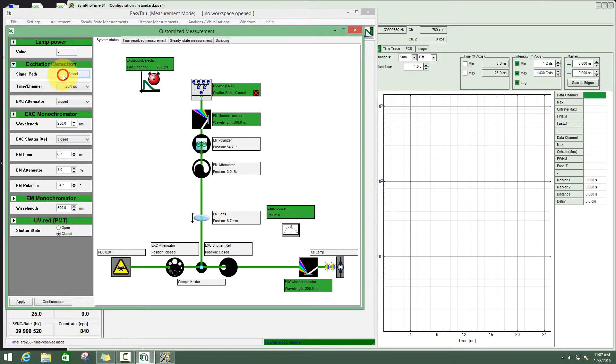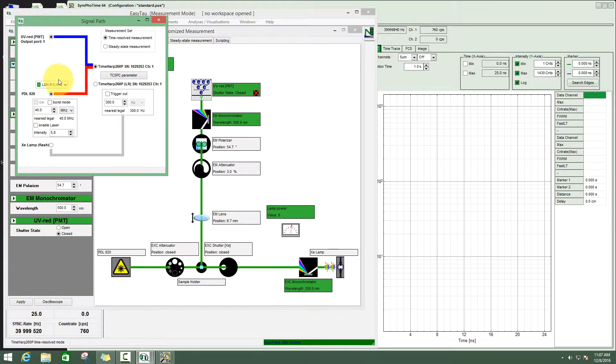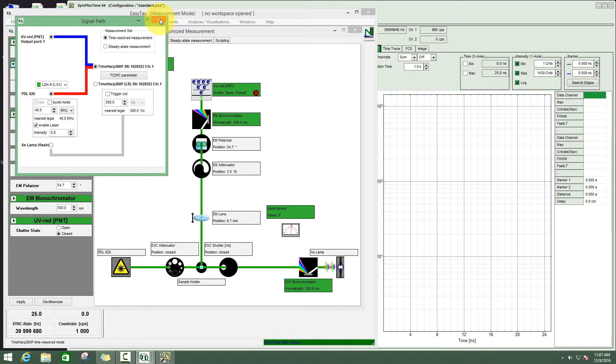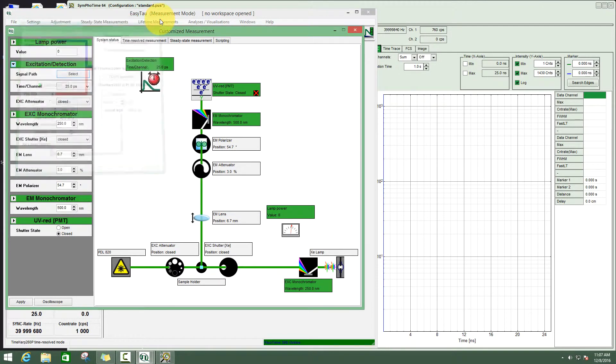We first select the laser. The 510 nanometer laser is already turned on, so we can just enable it. Close this window.